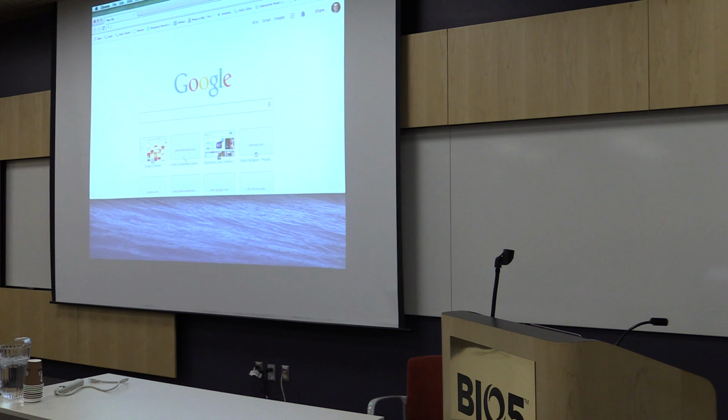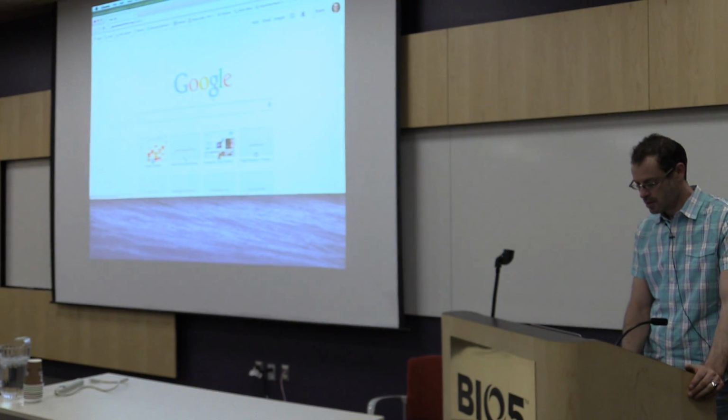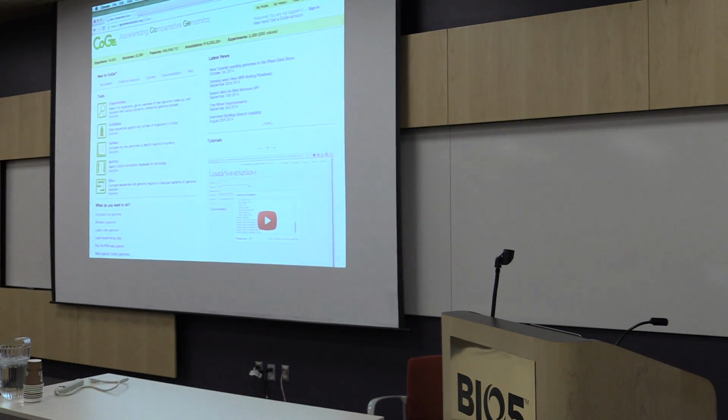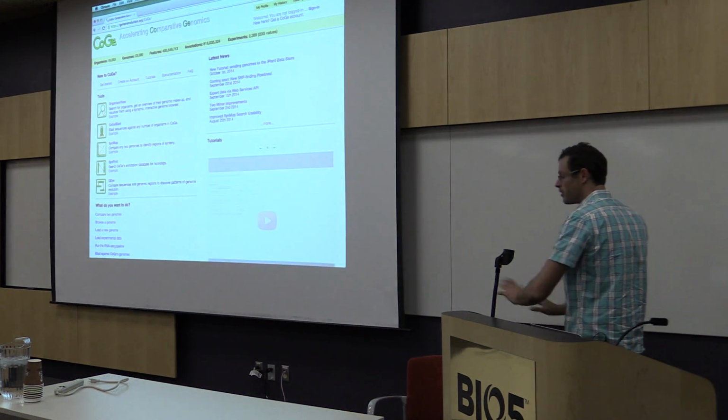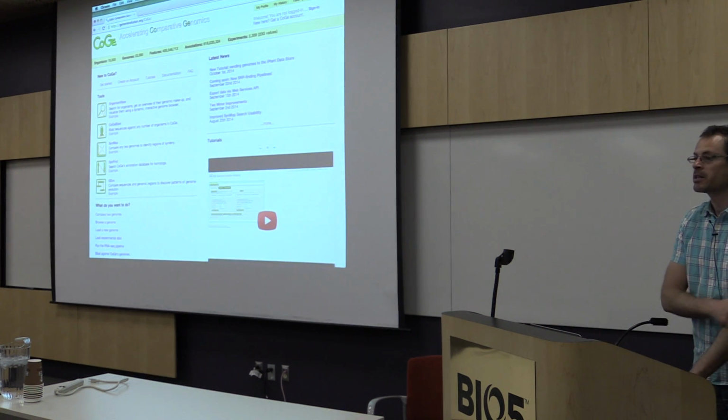Okay, so what we're going to do today is use a program powered by iPlant. And this is, like I said before, one that my group maintains called CoGe. Just to give a brief history of the project, what we were really focused on was comparative genomics.